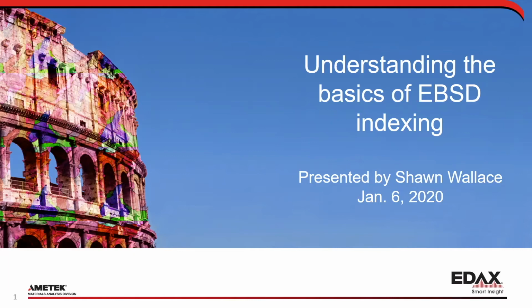We're going to talk a little bit about pattern quality, and then about image processing and why it's important for pattern indexing. We'll talk about the Hough Transform and how awesome it is, and why it's really important, because it's how we find the Kikuchi bands themselves. Then how we determine the orientation from those bands, and talk about uncertainties that arise, and of course calibration of the system, to understand how I am actually doing all this.